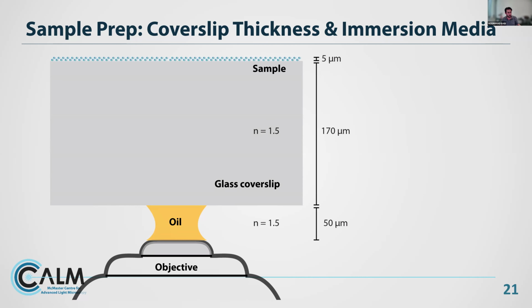So there's all sorts of different super resolution techniques, and they all have different requirements on the way that you need to prepare your sample. But regardless of which super resolution technique you use, or even if you're not using super resolution microscopy, you should always keep these concepts in mind if you want to get a nice image.